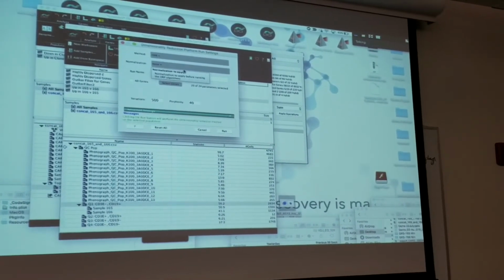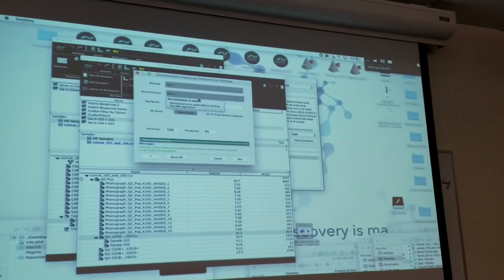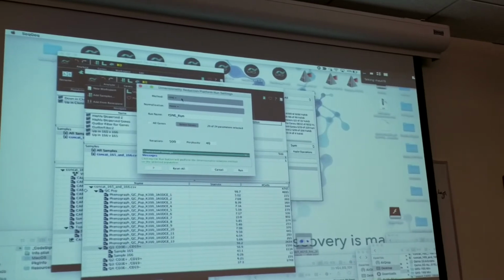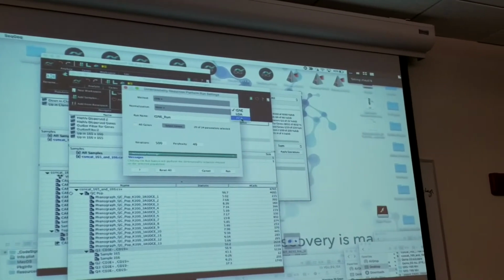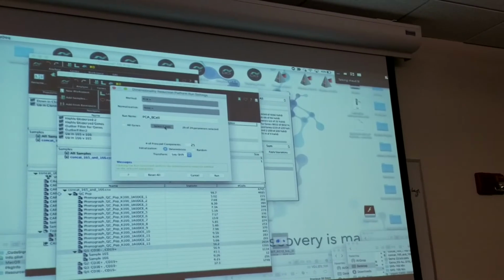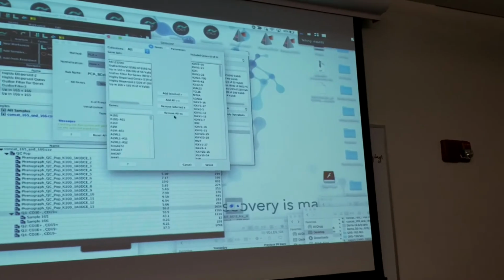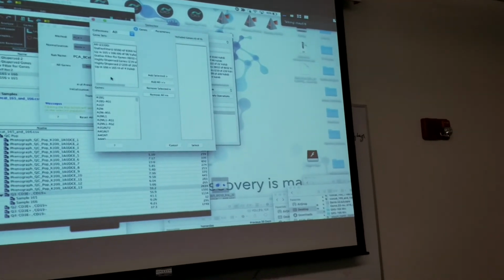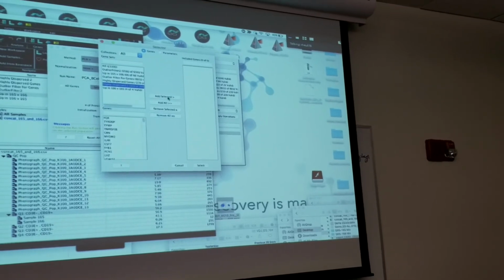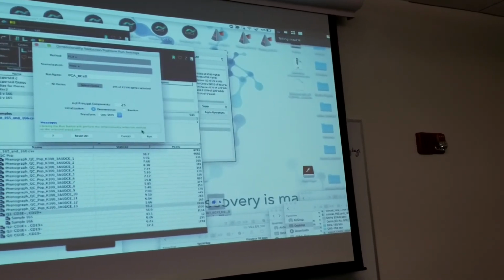All right. Okay. But in any event, were you making progress on finding a distinct population of B cells that's different in 165 and 166? If we get that far today, that would be great. And then we see what we're up against as far as V regions, and then we go from there to looking at the FASTQ files. I mean, it's those steps.